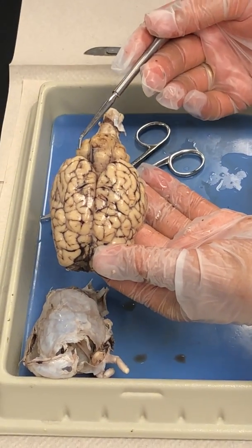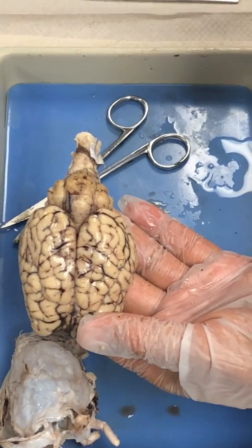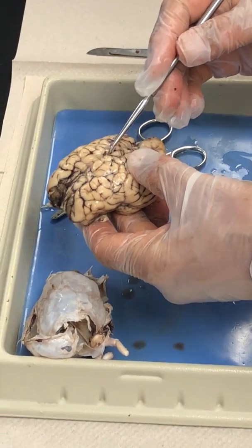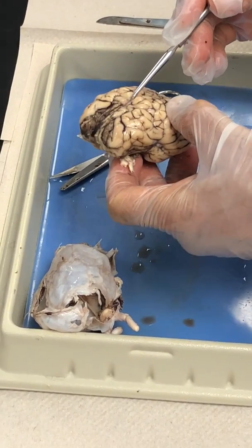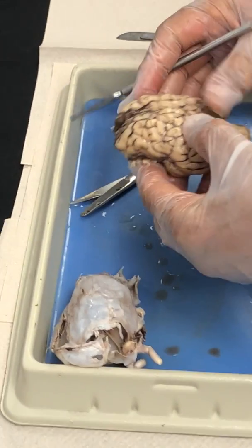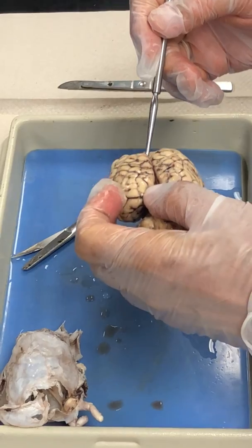This one is actually a very good sample in here, because when you look at the cerebellum, you can see the two halves in here, and you can see the vermis. That's the vermis that connects the two halves of the cerebellum. If you use your probe, you can try to separate. That's actually the inner layer of the meninges that I'm cutting through in here, and you can try to separate the two sections of the cerebrum. It's easy to do.